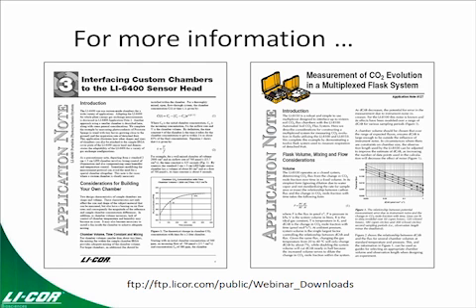Hey, thanks for the question, Ashley. And it's a really valid question. There's a lot of materials out there. Some are better for building chambers. Some are easier to work with. Ideally, for a gas exchange chamber where you're interested in measuring CO2 and water vapor fluxes, you want a material that doesn't sorb a lot of water vapor. The best thing that comes to mind is nickel-plated aluminum, but there's certainly plenty of plastics.